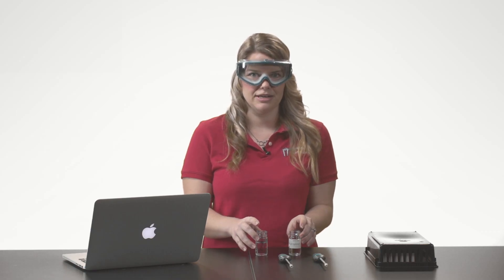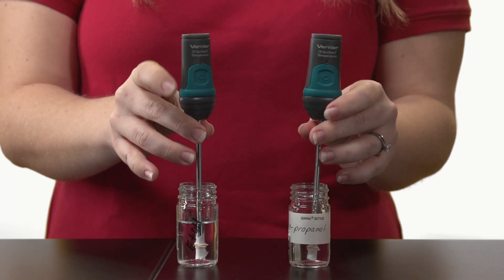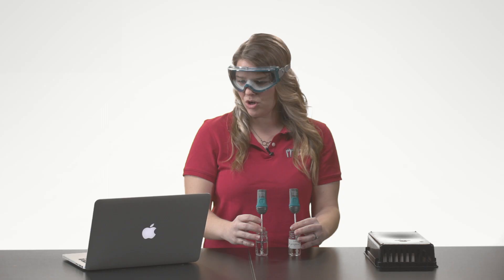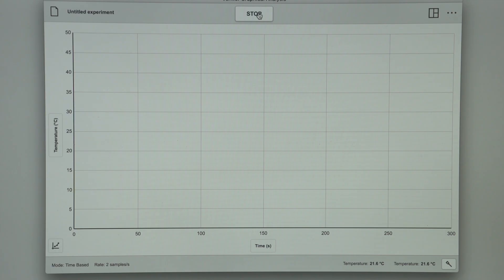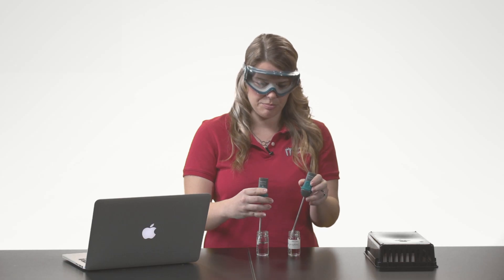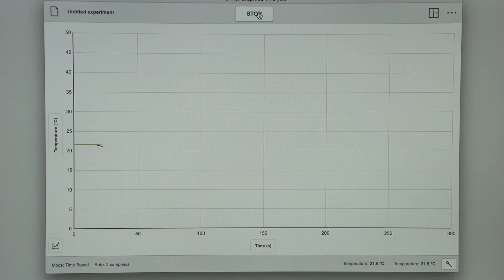My propanol and ethanol samples are ready. To begin the experiment, I want a few data points to get a baseline before evaporation begins. Go ahead and place the temperature probes in your solutions and let them equilibrate for a few seconds, making sure their temperature readings are stable. Then press the collect button and collect a few data points for a nice baseline for your initial temperature reading. Then remove the temperature probes and place them on the edge of the desk or an elevated surface, making sure they are not touching anything. At the end of 300 seconds, the data collection will stop.